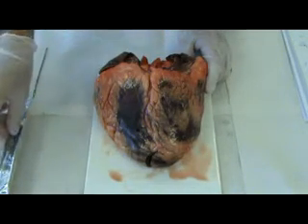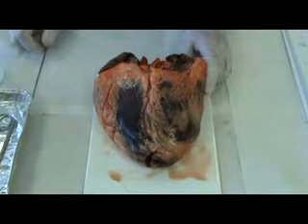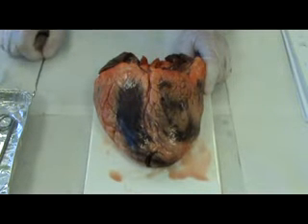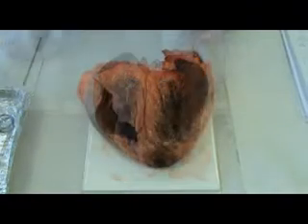So the coronaries certainly need to be free of any obstructions, and ideally they shouldn't get hard with cholesterol. They need to be carrying sufficient blood and nutrients, including oxygen, to the heart as it's beating, and also to carry away the wastes of metabolism.